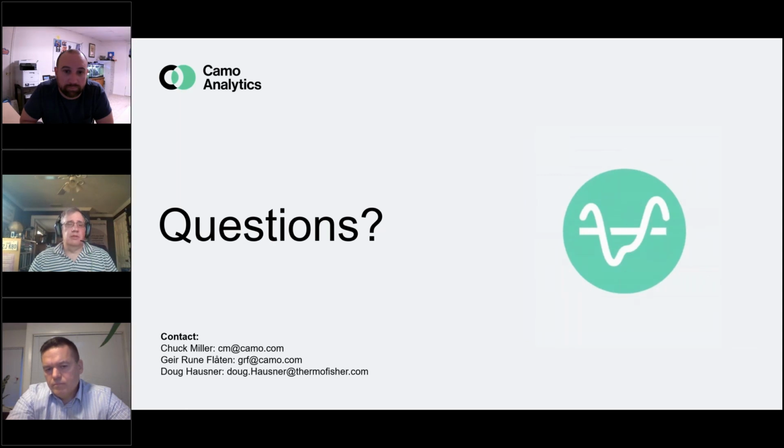I think it's just a general principle. And one thing I also did want to mention going back was, Doug, you mentioned this previously before the webinar. I think one of the nice values of continuous and PAT in general is bringing access to what you call more difficult chemistries.